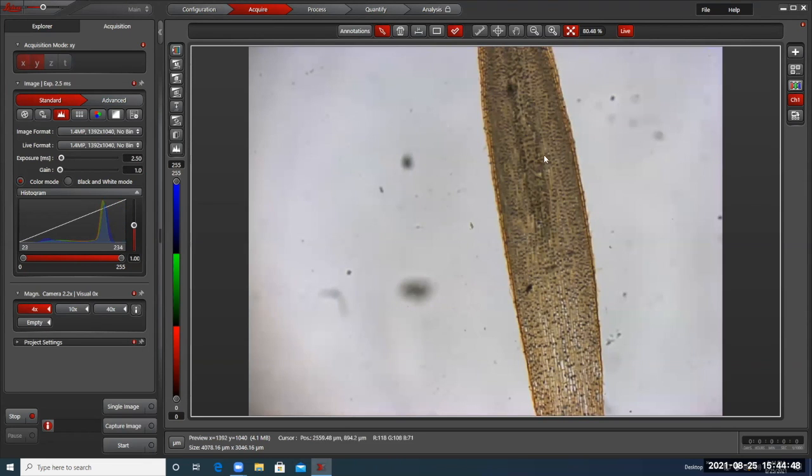All right, that seems pretty good. I'm going to go 2.75. Boom. Okay, so the histogram's looking, you can see it's a little jerky. That's because the light's a little off, but that's okay. So that would be 10x. We can't actually, or sorry, 4x.